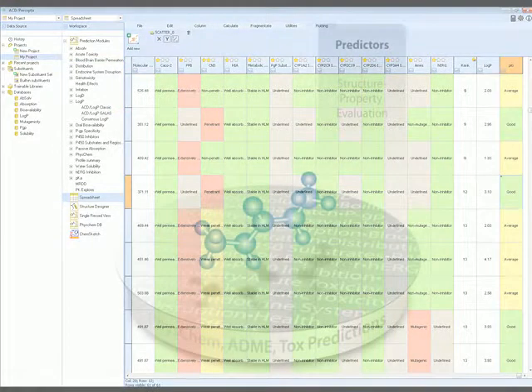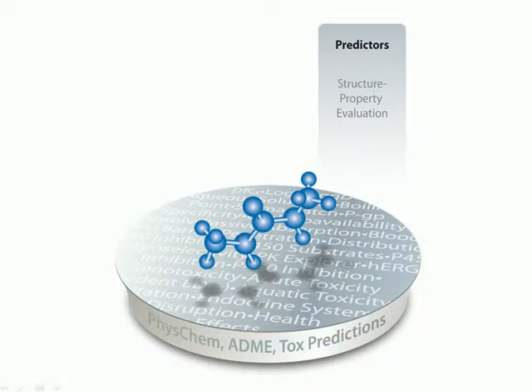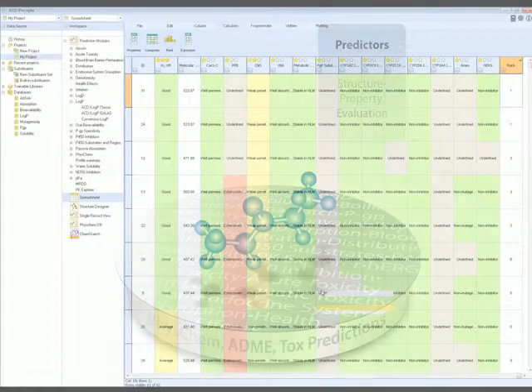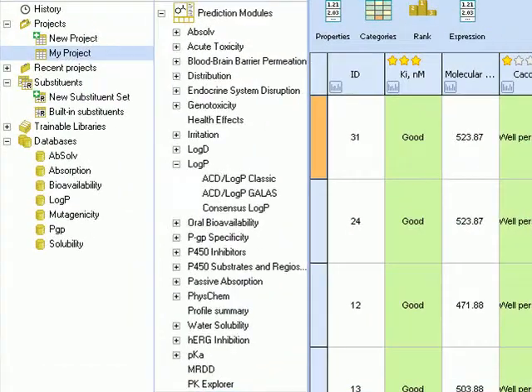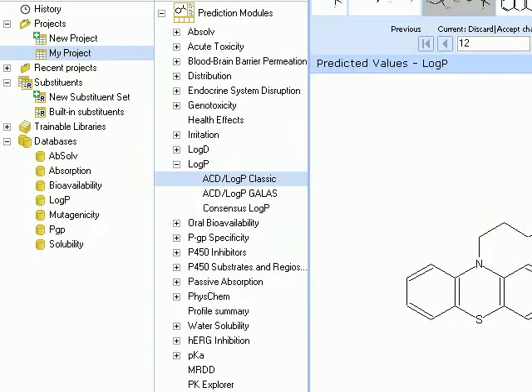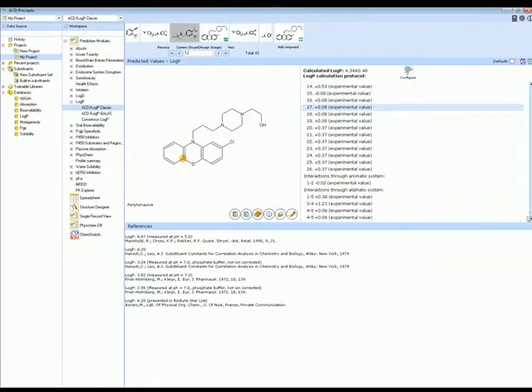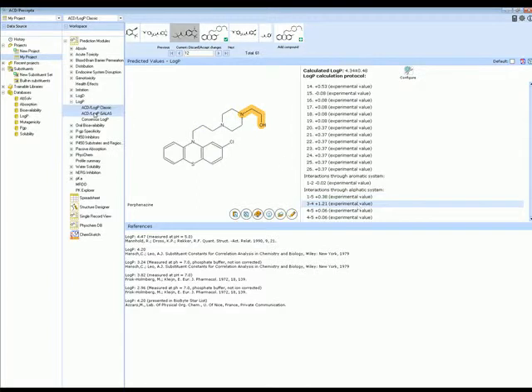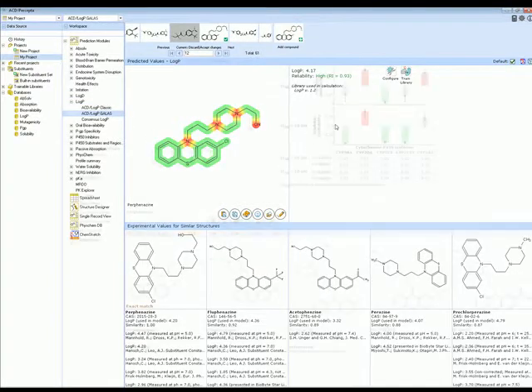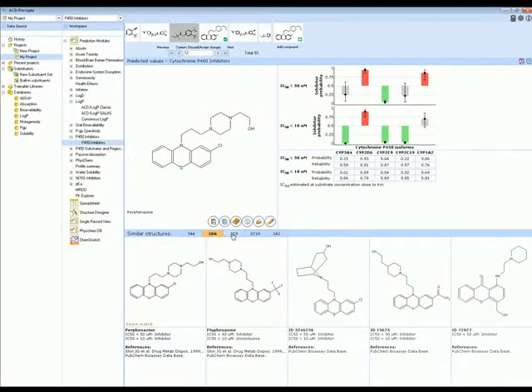For in-depth study of structure-property relationships, choose from the individual prediction modules that power all Percepta products. Choose from a number of different models for prediction of physicochemical properties, such as logP or solubility. Each module provides property-specific details, such as calculation protocols, color highlights to indicate atomic and substructure contributions, and the ability to train the models with your own experimental data to increase accuracy for proprietary chemical space.